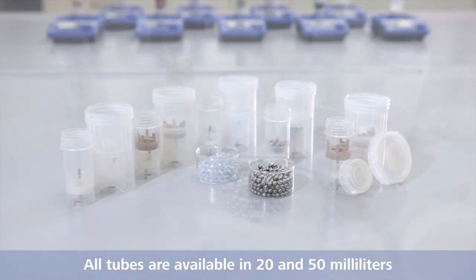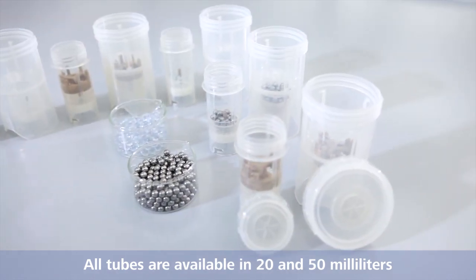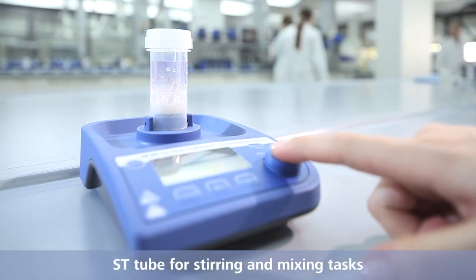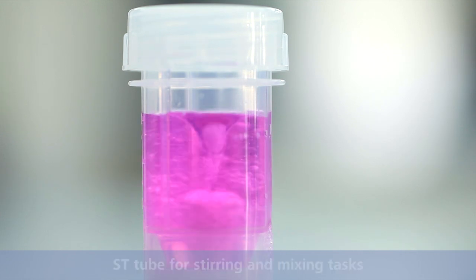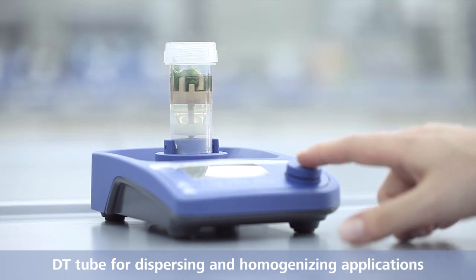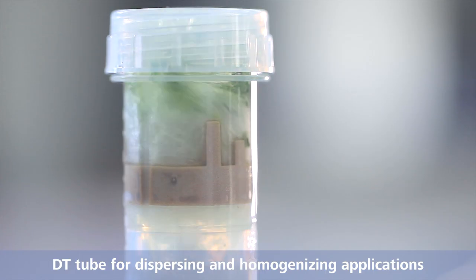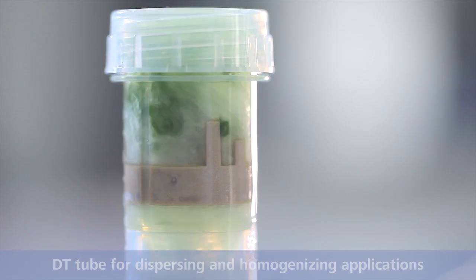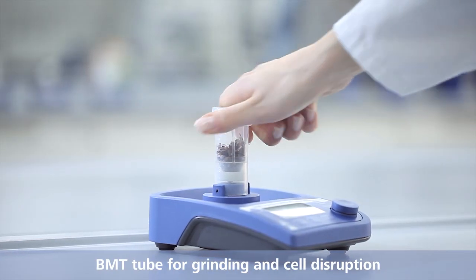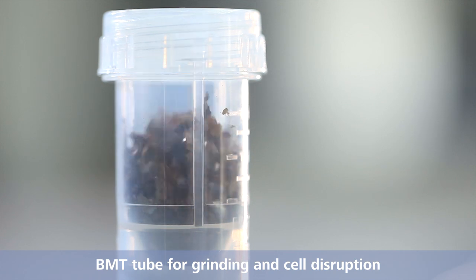All tubes are available in 20 and 50 milliliters. ST-tube for stirring and mixing tasks. DT-tube for dispersing and homogenizing applications. BMT-tube for grinding and cell disruption.